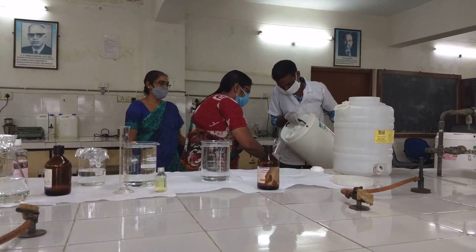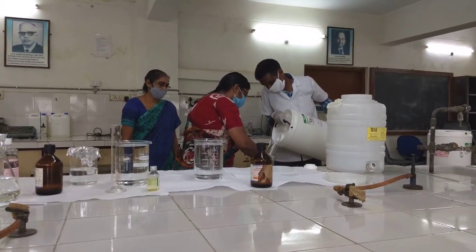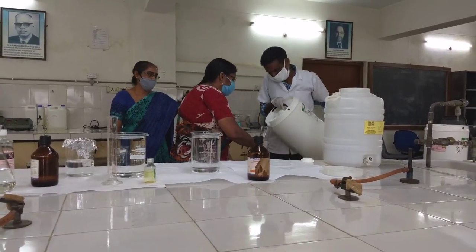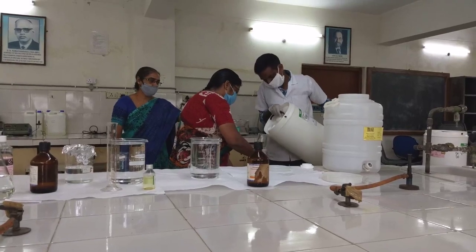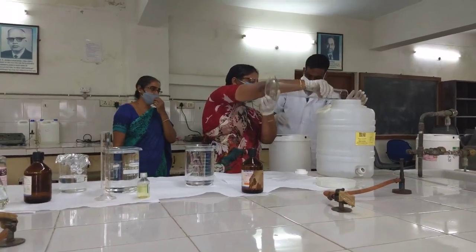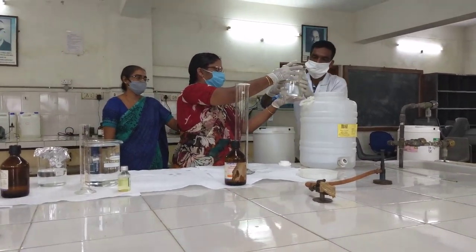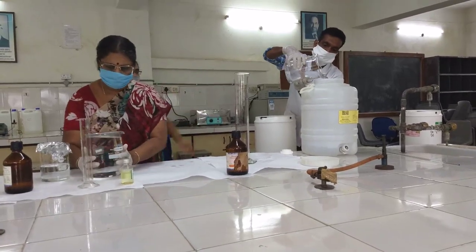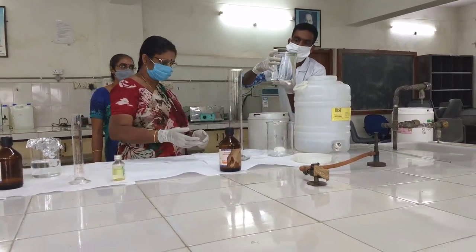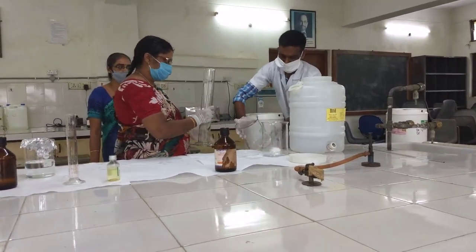We have dispensed 1 liter. Now we are collecting the next liter — that is the second liter being transferred. The second liter is dispensed into the container required for preparing the hand sanitizer. So 2 liters have been added, then the next 2 liters, making it now 4 liters. These 2 liters and 2 liters already measured in the container have been taken. So 2 plus 2 plus 2 comes to 6 liters now.